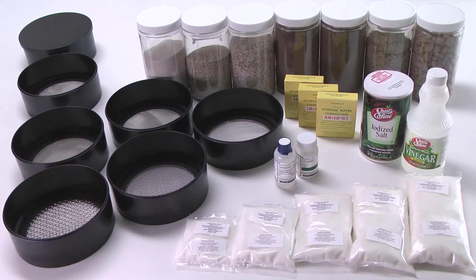Environmental variations can be investigated as students manipulate environmental conditions through sensory testing with various substrates such as sucrose, fructose, sodium chloride, acetic acid, sodium hydroxide, and pH buffers 4, 7, and 10, as well as variation of habitat media such as soil types. The screen sieve set can also be used to vary particle size in these types of studies.